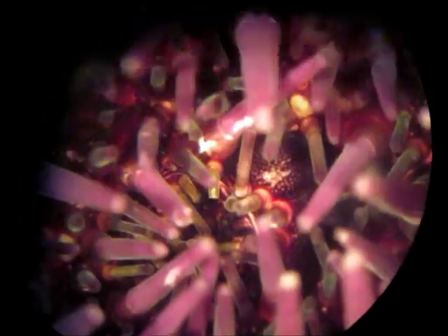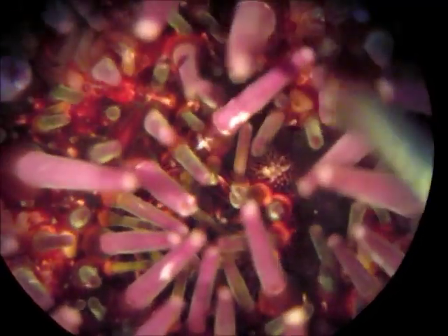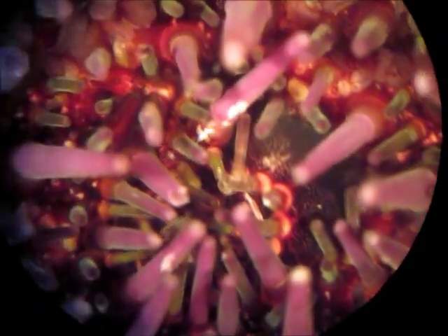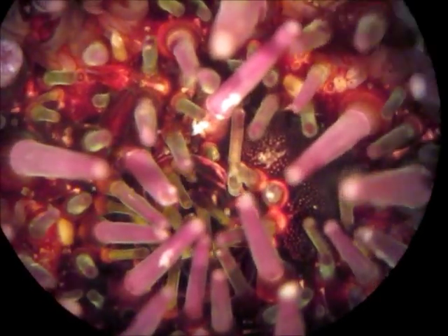I'm going to touch the madreporite with a probe so you know what I'm talking about. The water vascular system is a pressurized water system that allows the spines as well as the tube feet to move around. It also creates the suction associated with the tube feet, so this allows for the animal to move as well as attach to substrates and move things around.